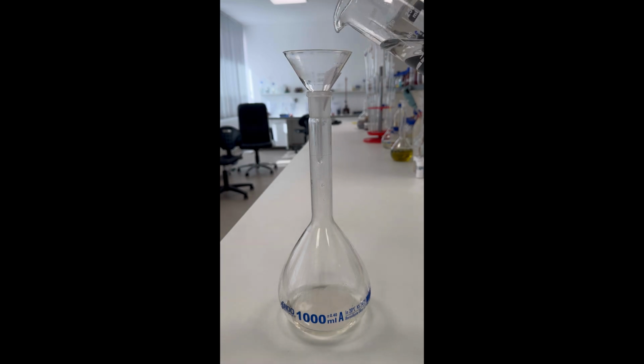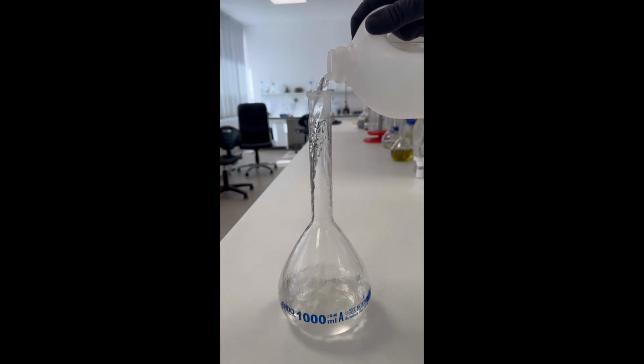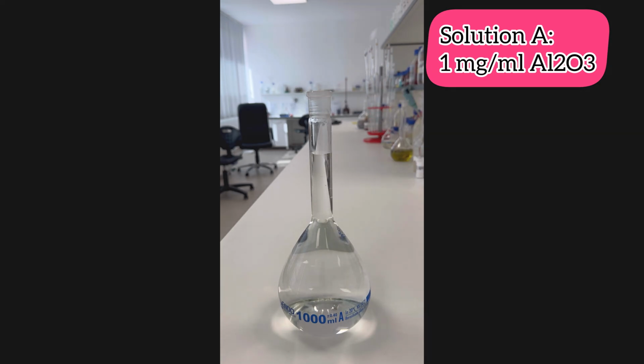The beaker is washed twice with distilled water and removed. The solution in the flask is then topped with distilled water to the mark. This solution is denoted with A, and its concentration is 1 milligram of aluminium oxide per milliliter.